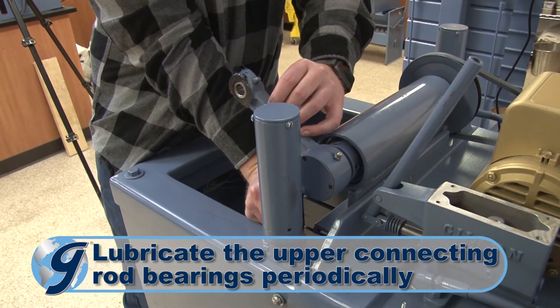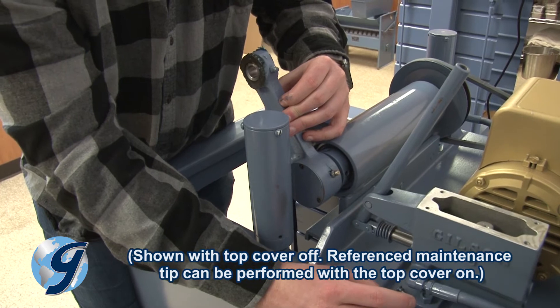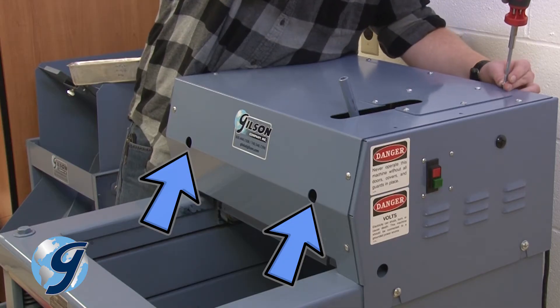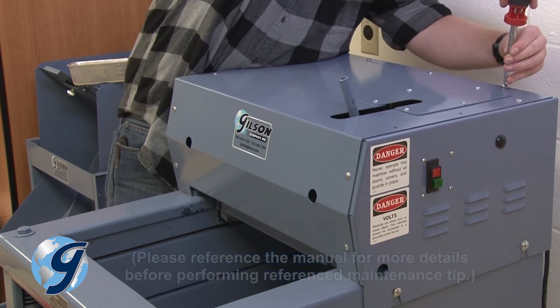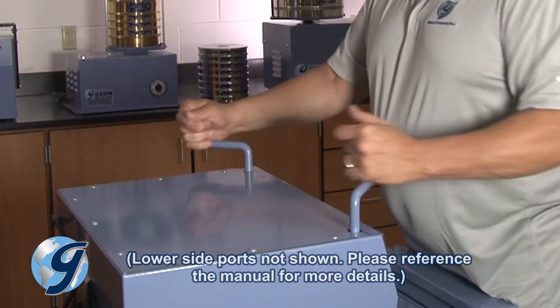Periodically lubricate the upper connecting rod bearings, again using a standard grease gun with high-quality grease. Access the connecting rod bearings through holes in the front of the top cover on the TS1, TS3, and TS4, and for the TS2, through ports on the lower sides of the machine case.